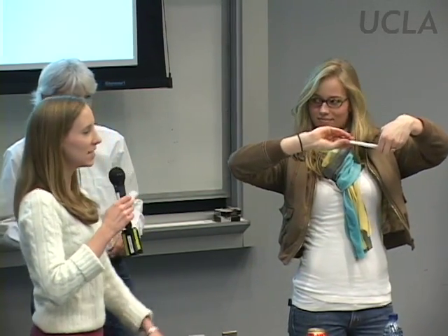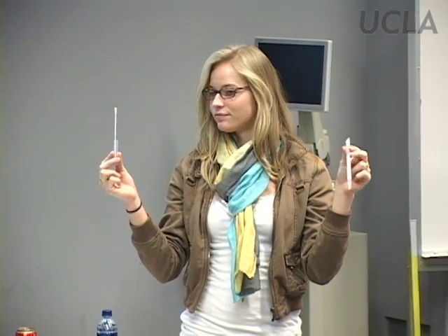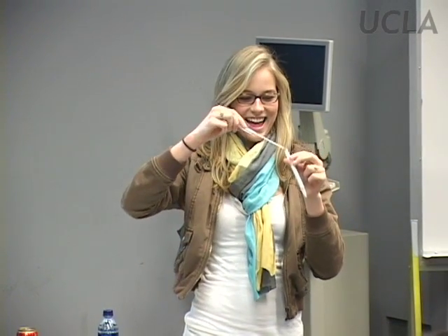So twist open the container, like Daisy, pull apart. Daisy, stand up. Everyone figure out how to open? Just twist in the center, pull apart. All right, then take your swab. Oh, sorry, my bad. So rinse first. Okay, so put it back.